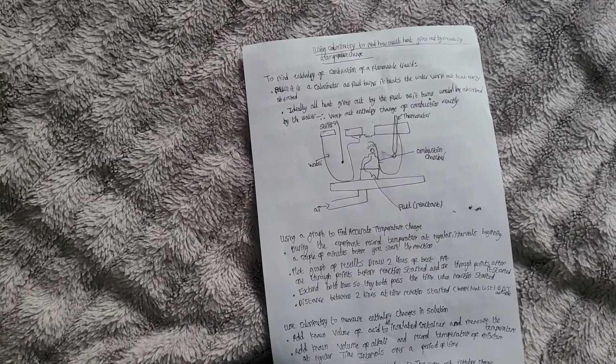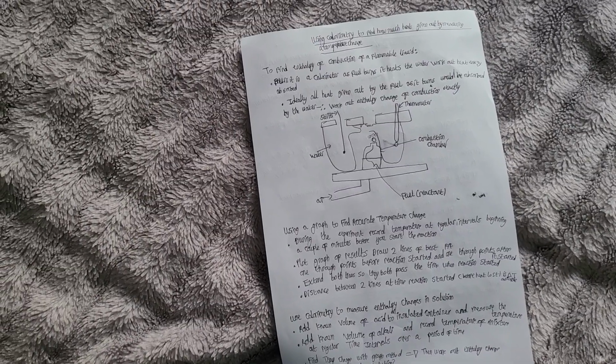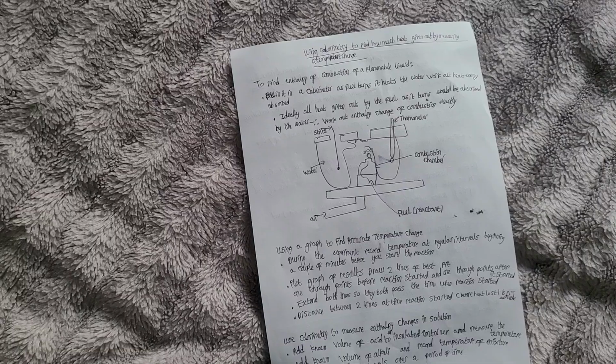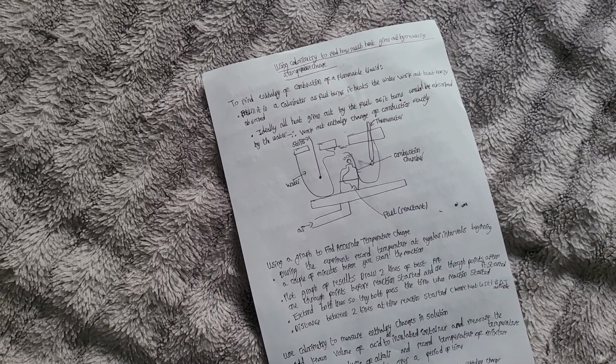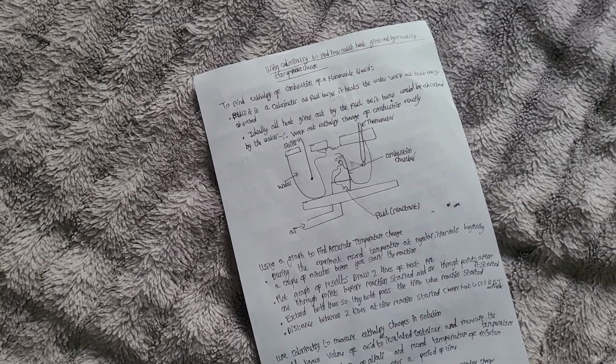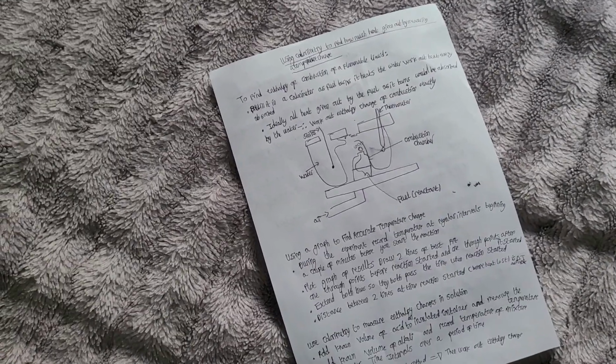Therefore, we could work out the enthalpy change of combustion exactly. But that will not happen: heat loss, incomplete combustion, etc. So here's all the equipment: water, stirrer, air going in, fuel, reactant, combustion chamber, and thermometer.